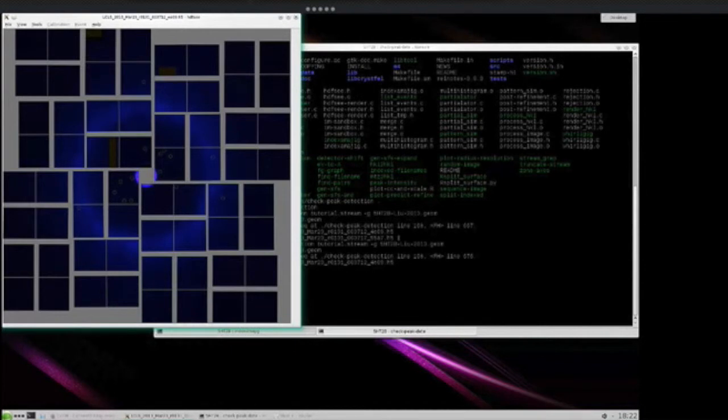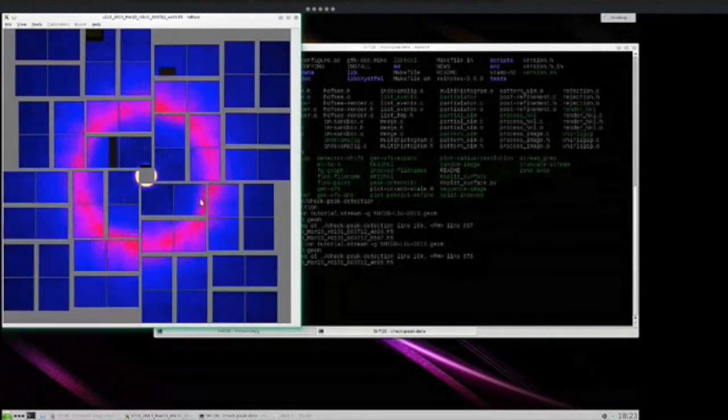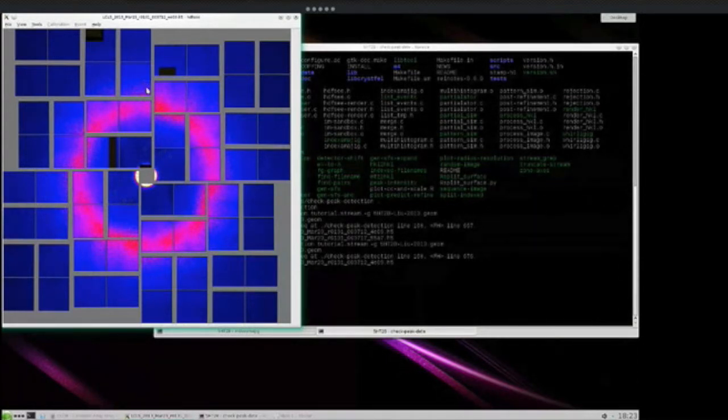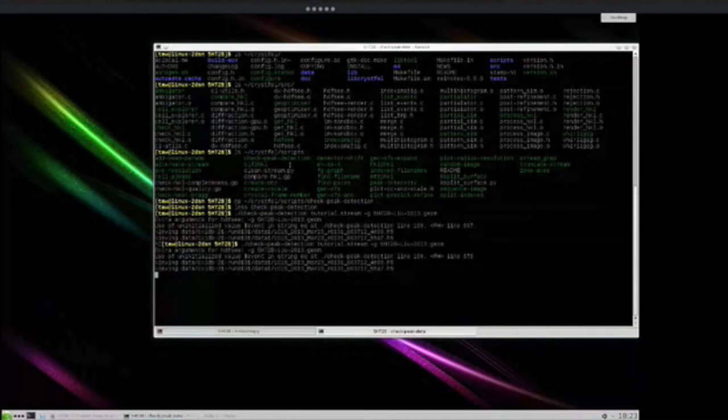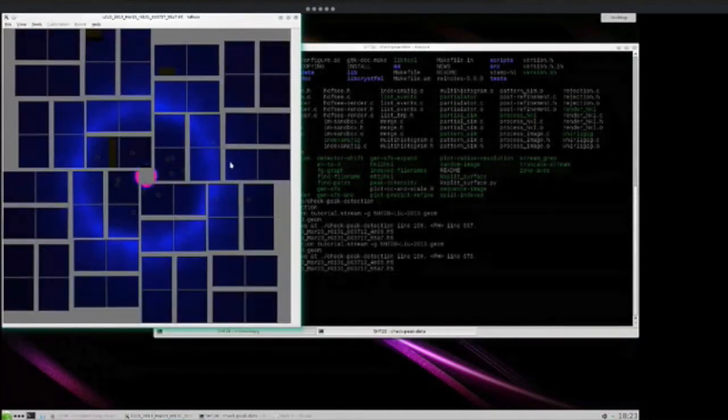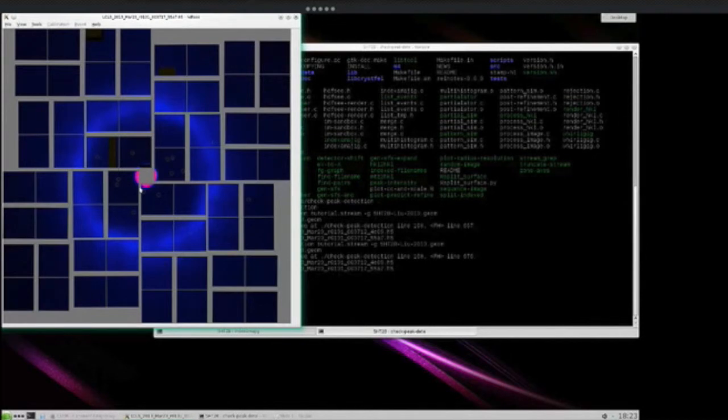So you see it looks a lot better. It's picked out a much higher number of peaks. In fact, now it's possible that there are some misfound peaks here. So these all look real, but these ones at the edges here, these could just be noise coming above a threshold. Let's close that. Look at the next one. Again, similar story. So maybe some outliers here, but main peak detection is looking good.